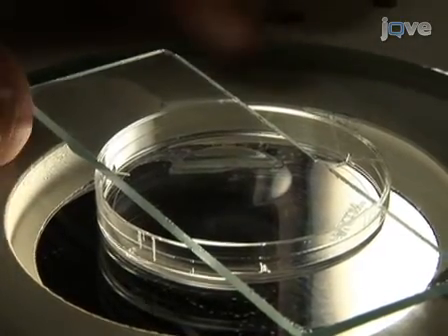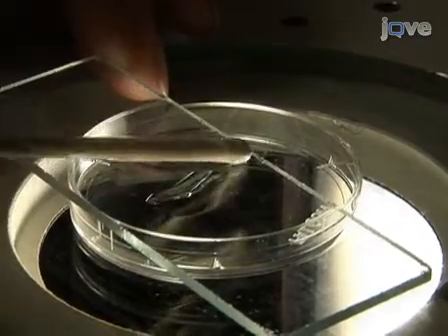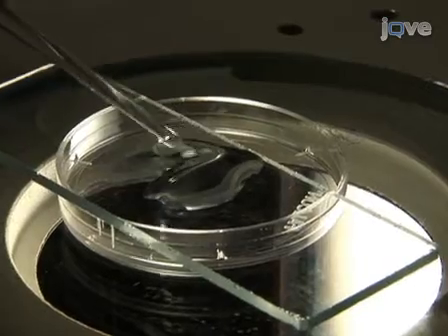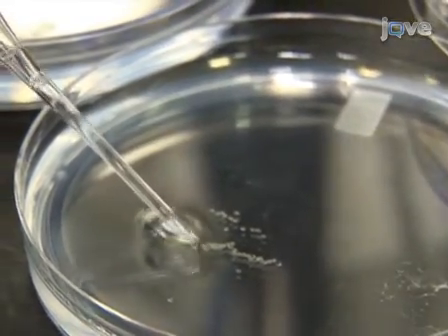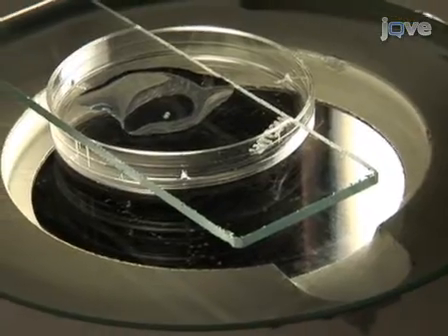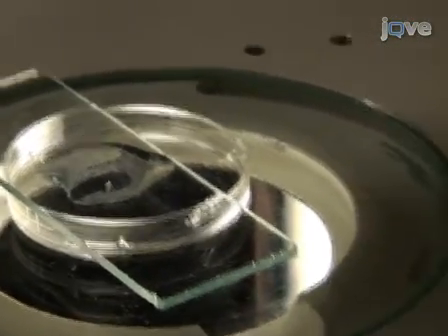To mount gastrulas, first, smear a vertical stripe of methylcellulose in the depression of a glass depression slide. Then flood with a generous amount of pen strep embryo medium. Using a fire-polished pipette, transfer 1 donor and 3 shield stage hosts to the depression slide. Select donor embryos that are slightly younger than the hosts.